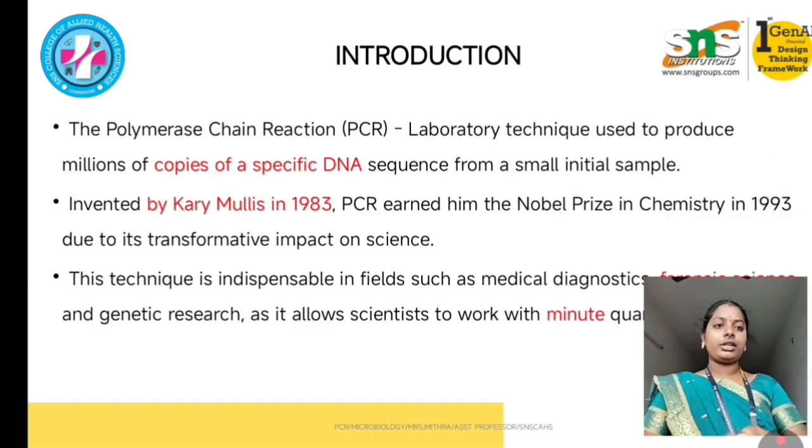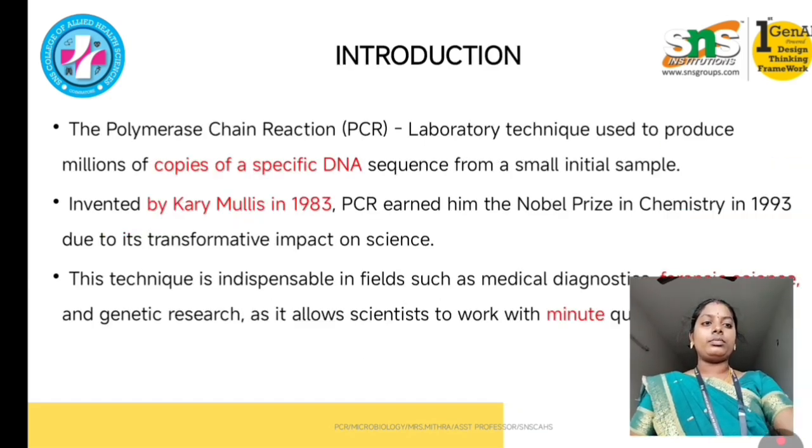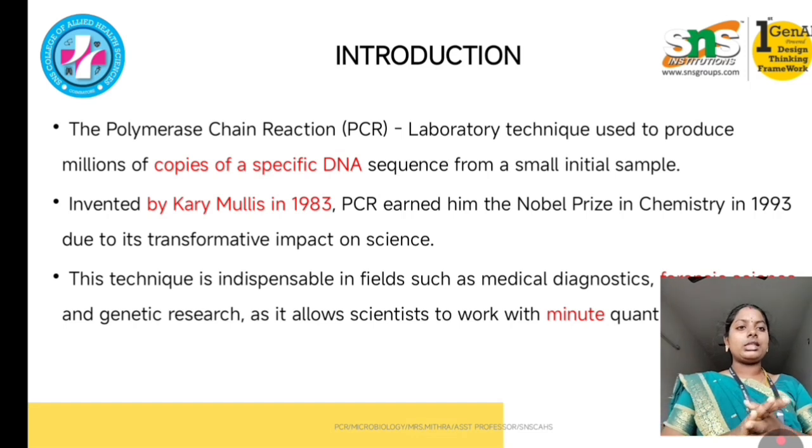So coming to the introduction, PCR is a laboratory technique which is used to produce millions of copies of specific DNA. So one DNA gets amplified into millions of copies from only a small sample of DNA.